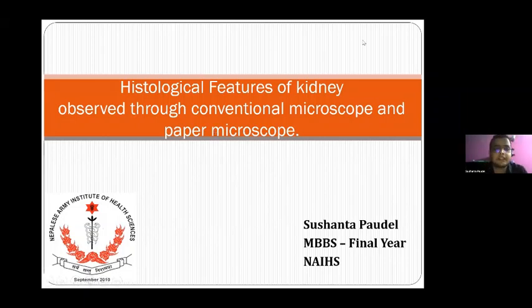Today I am Sushanta Paudel, a final year MBBS student at Nepalese Institute of Health Sciences, Kathmandu, Nepal. And today I am going to present this paper on my research that was based on the histological features of kidney observed through conventional microscope and paper microscope, that is a foldscope.